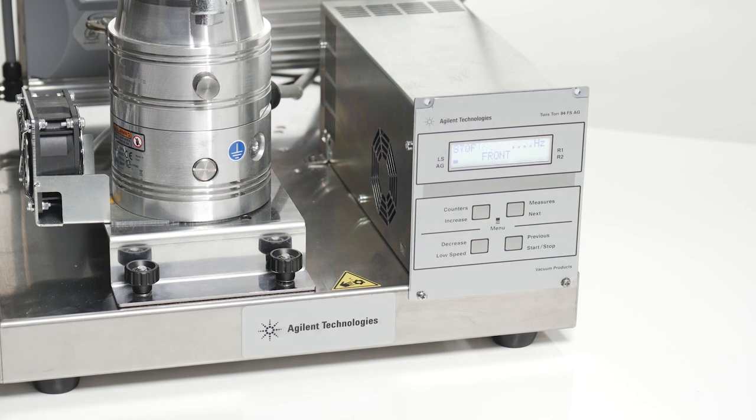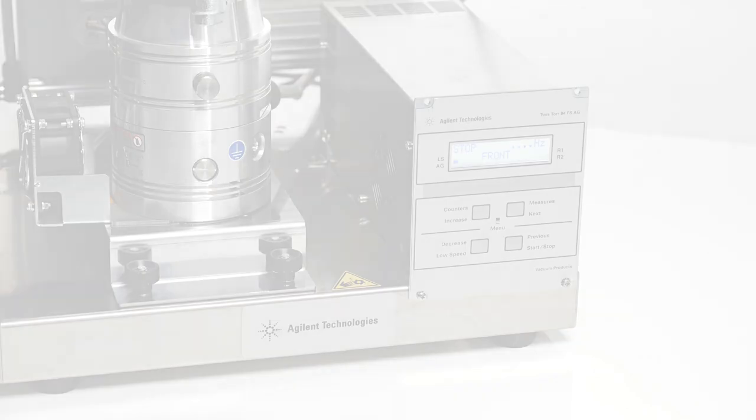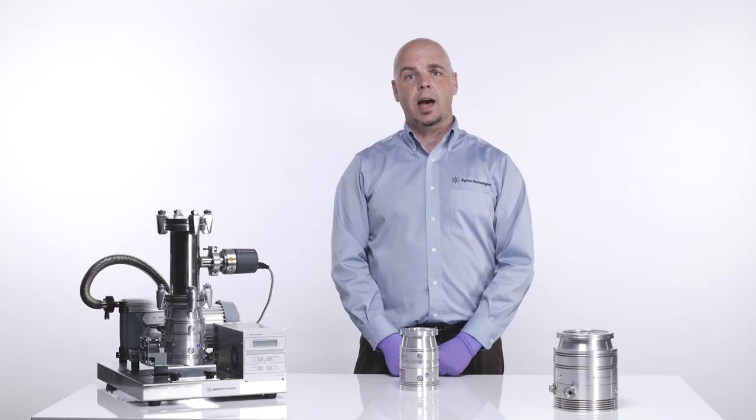Now we can safely turn off our unit. I'm Bartley Carlson with Agilent Technologies.